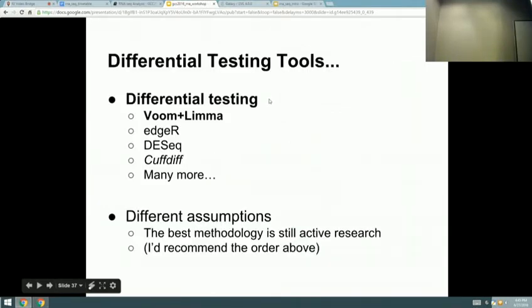So there are a few count-based methods for doing differential testing. Limma is another one. It's similar to edgeR. It's written by similar authors. I think they work at the same institution in Melbourne. edgeR and DESeq2 use the same statistical model. It's called a generalized linear model. I'm a fan of edgeR, but I'm biased because I'm from Melbourne, but voom and limma is also a good method. They have very similar results, as you'll see when we compare our significant gene results in the next section.